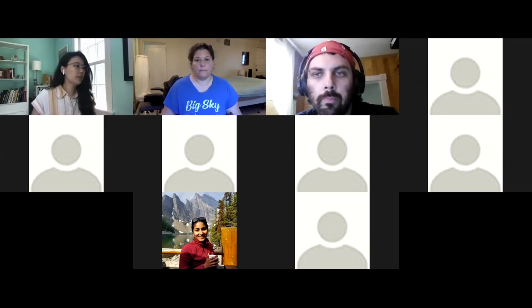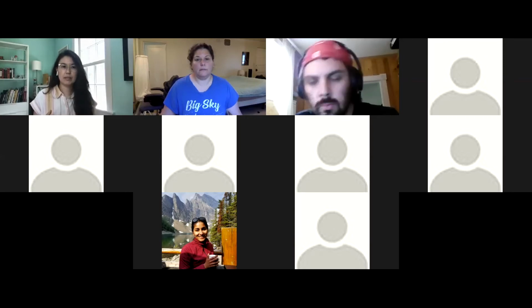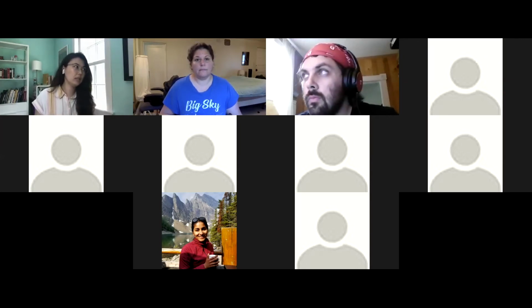And what Liz went over last week was really great. It was looking at ordinations, but from the phyloseq object. So you're using the phyloseq object and then making ordinations. Today I'm doing a little bit of a different approach, but we're talking about a lot of the same things. I use phyloseq a lot, and I also use non-phyloseq, so I'll talk about that a little bit. And if you're from the Amplicons group, this is lesson 5b in the Amplicons lesson numbers.